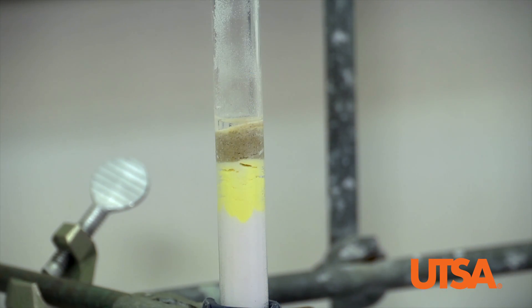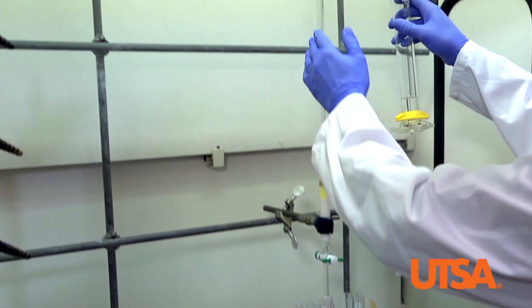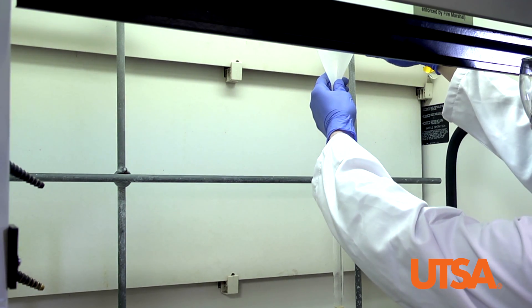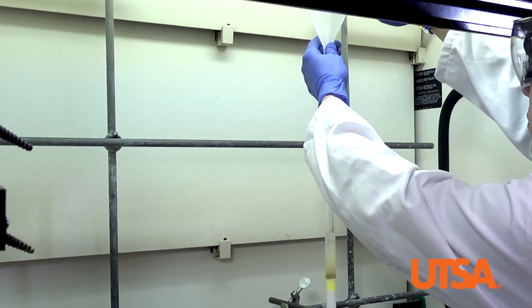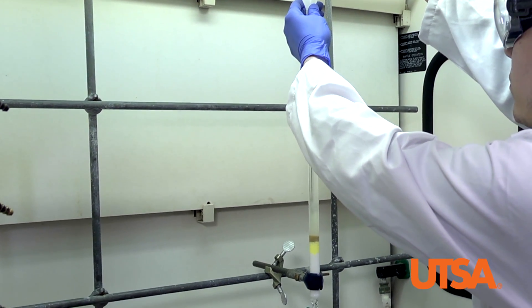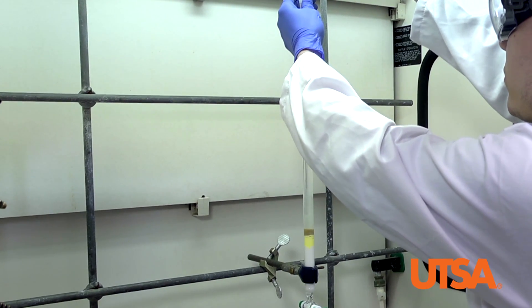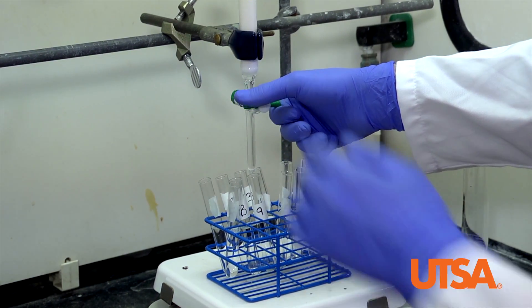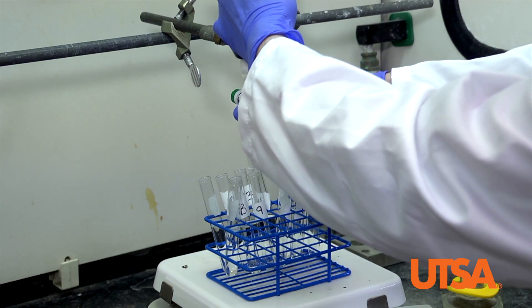Once the petroleum ether has eluted to the top of the sand, add 20 milliliters of dichloromethane to the column. Open the stopcock and finish collecting your next fractions.